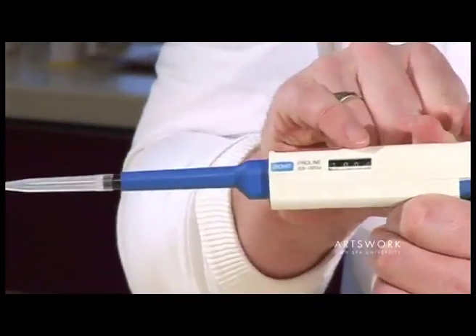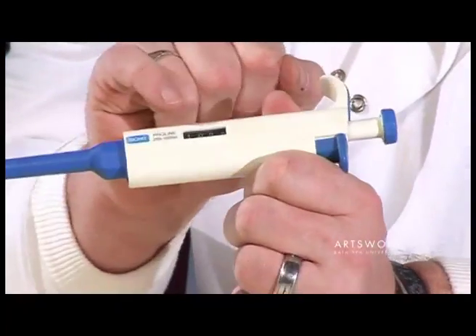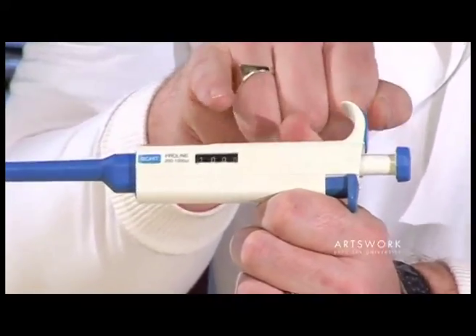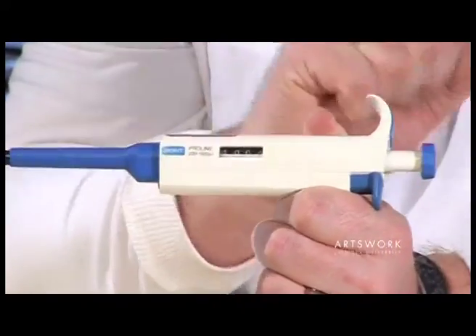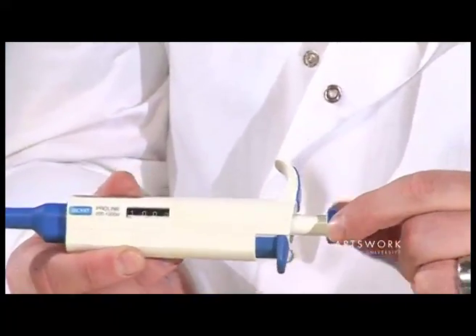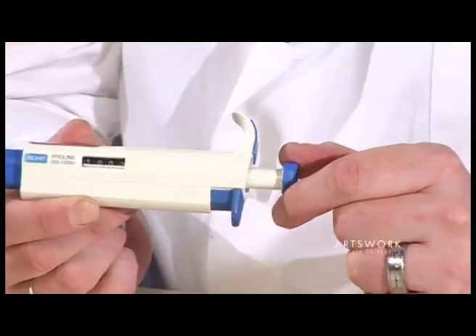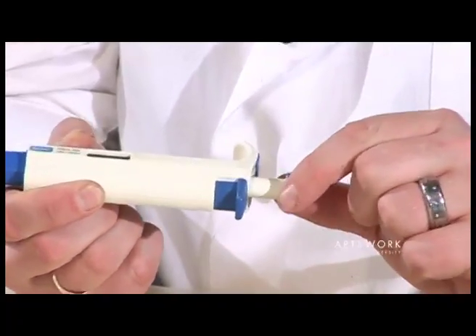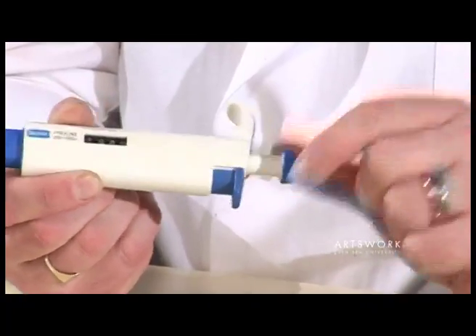We then need to check that the volume set is accurate. These pipettes are marked in microlitres, which are thousandths of a millilitre, so one millilitre is equivalent to a thousand microlitres. The volume itself is set just by turning the wheel at the top of the plunger — turning it forwards and backwards. In this case we want it set to one thousand microlitres to pick up one mil.